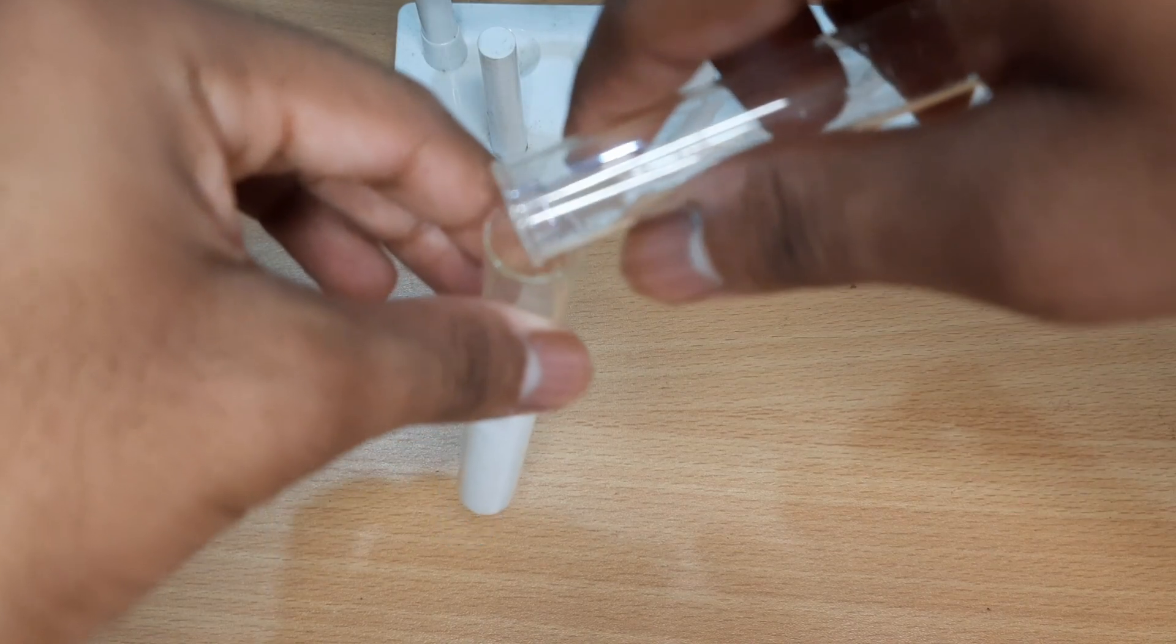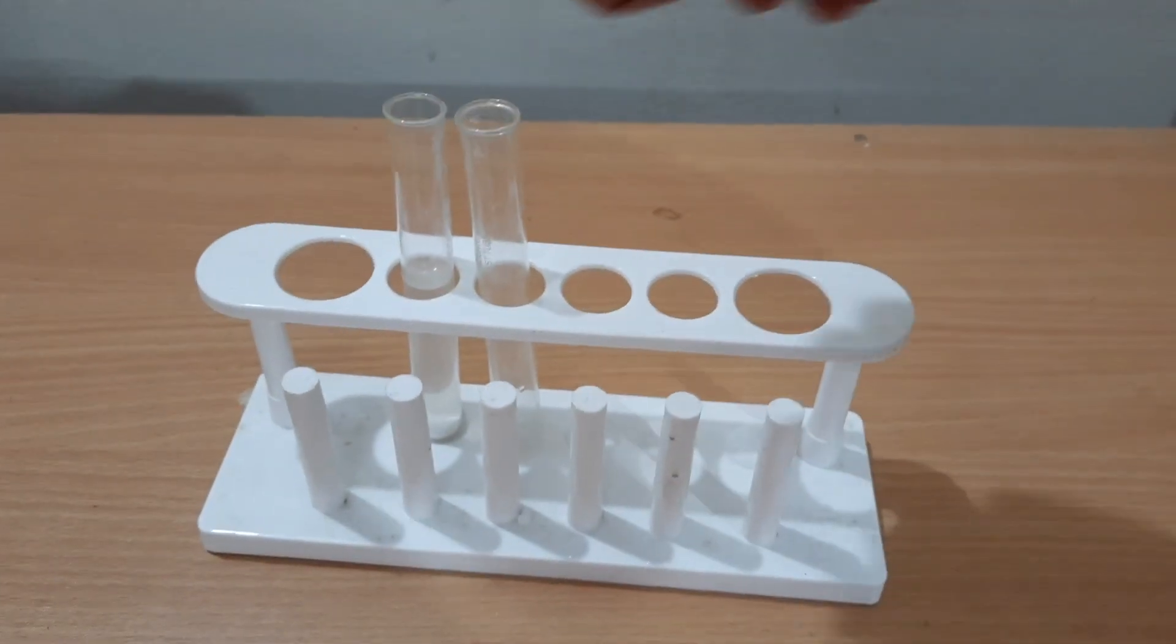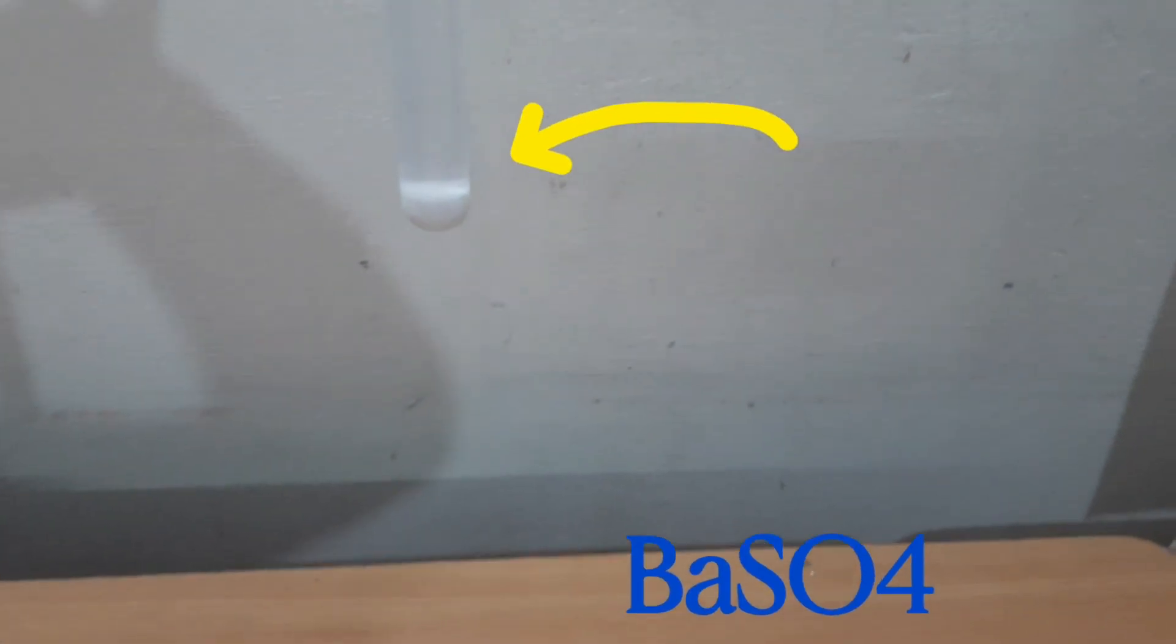Barium ions of barium chloride react with sulfate ions of sodium sulfate to form barium sulfate. A few minutes later, the barium sulfate is formed as a white insoluble solid.